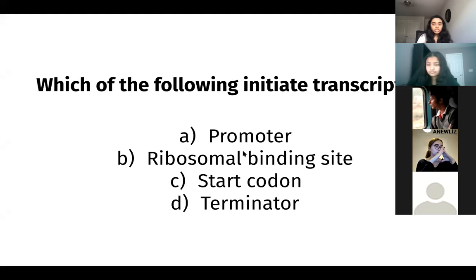Okay. We are getting some mixed responses for this one, so I'm going to go over it in the next slide. The answer is A, promoter, but I'll go over why in a second.